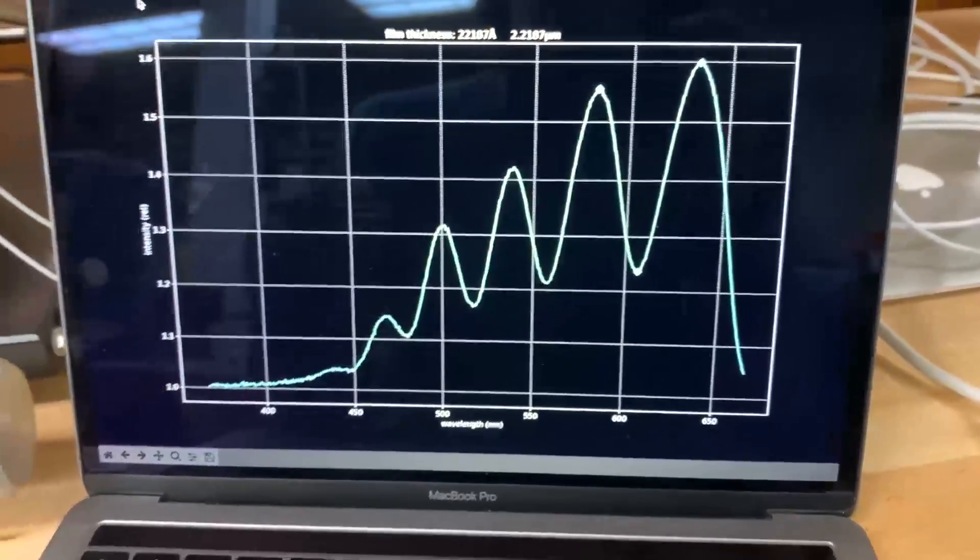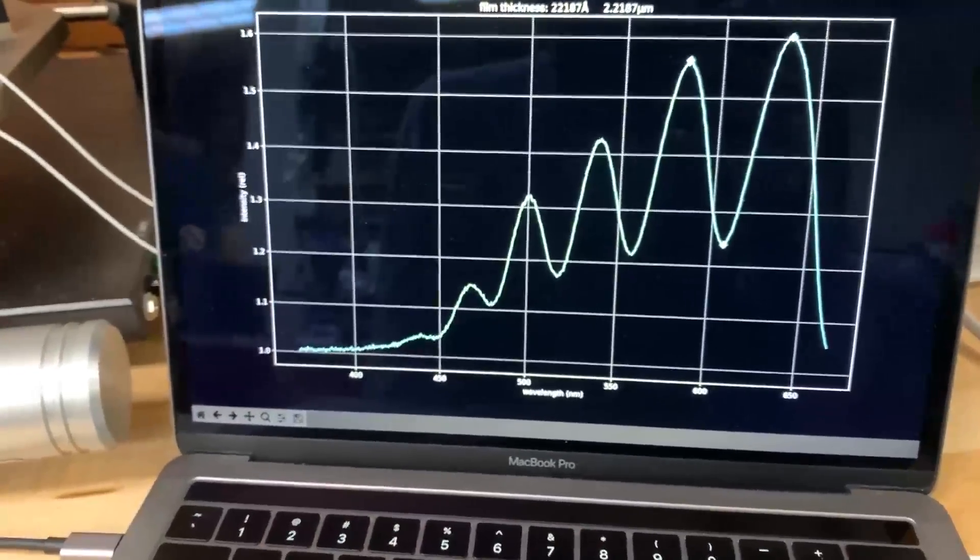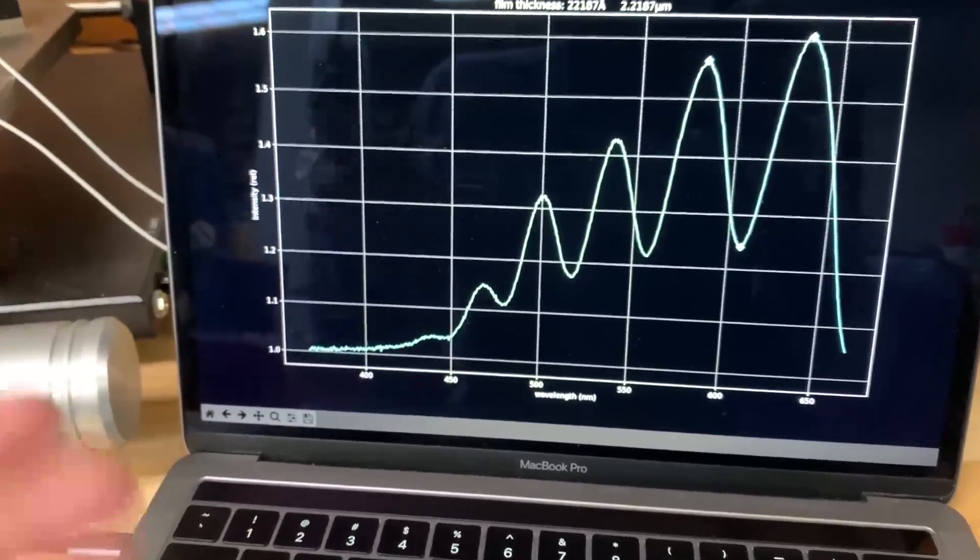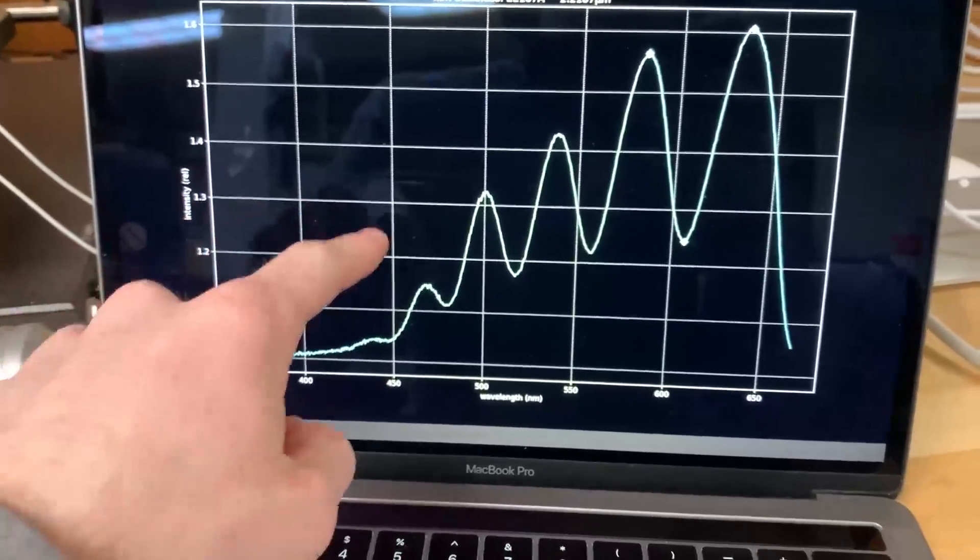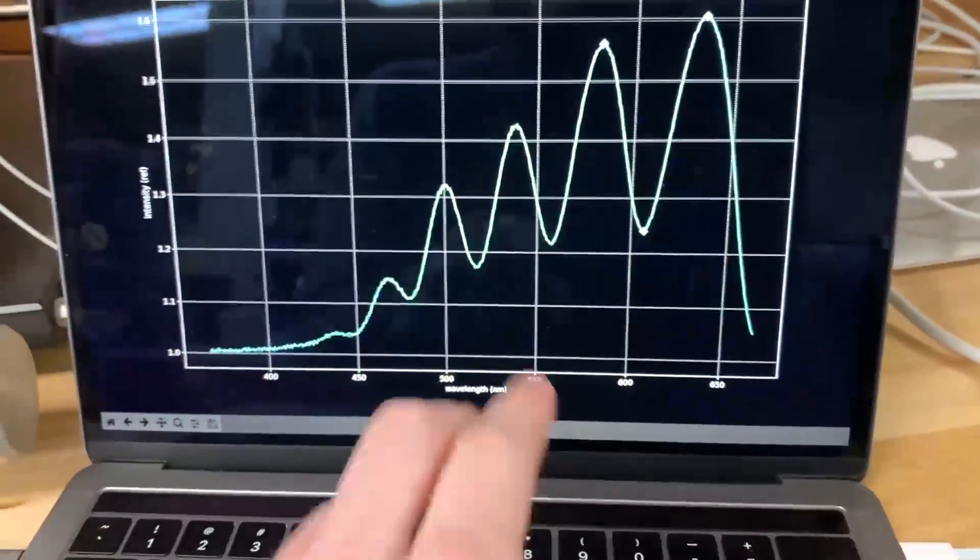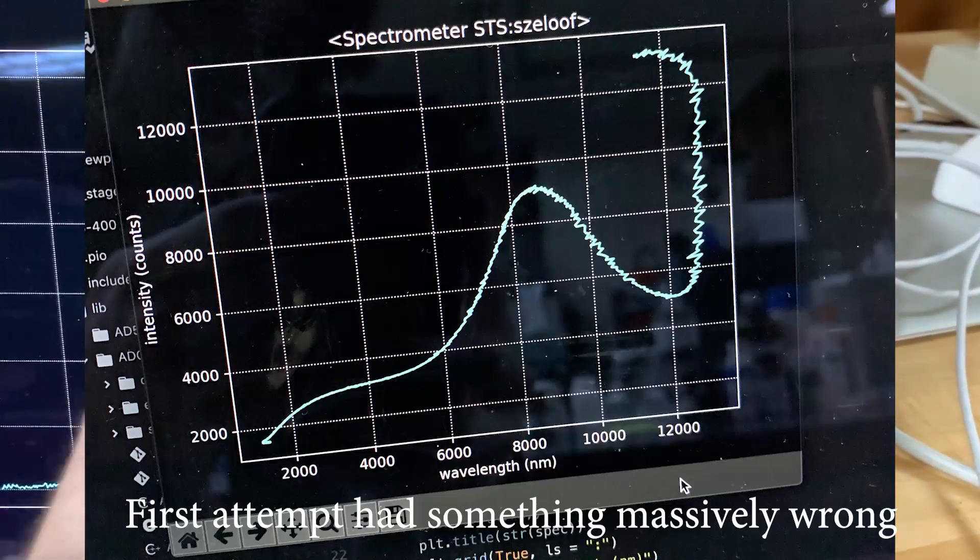In any case we have a film of some thickness and different wavelengths will go through that film or be reflected off that film with different intensities. So that's all we're measuring here is kind of the relative intensity of all these different wavelengths.